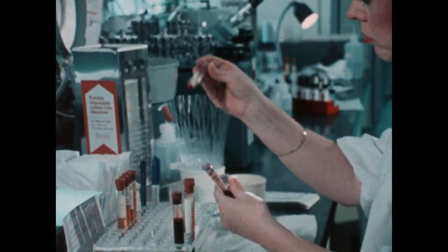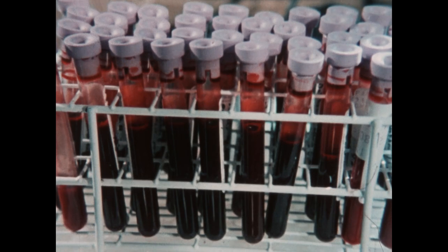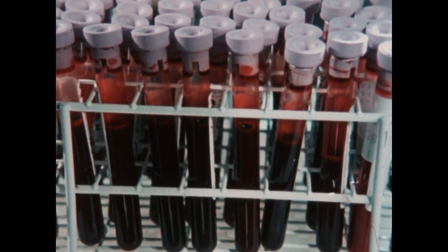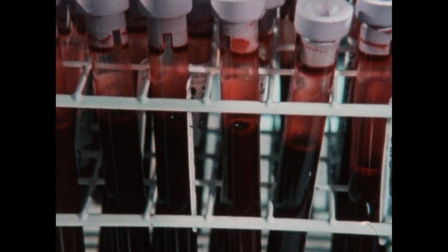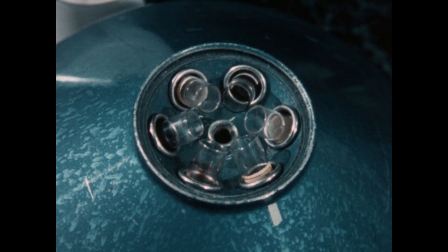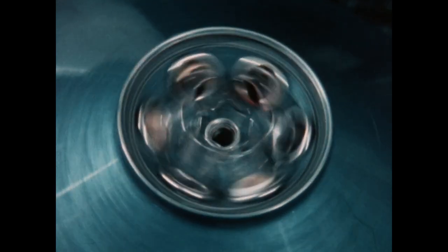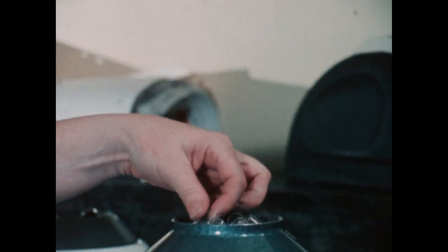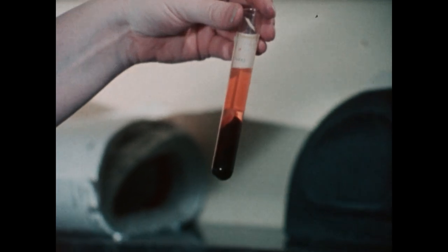A hematologist might want to separate out just the red blood cells from this mixture. They happen to be more dense than other components of blood, so that physical property can be put to work to make the separation. A centrifuge does it. Centrifugal force pulls the denser red blood cells out of their nearly homogeneous distribution in the mixture and concentrates them at the ends of the tubes in the centrifuge.